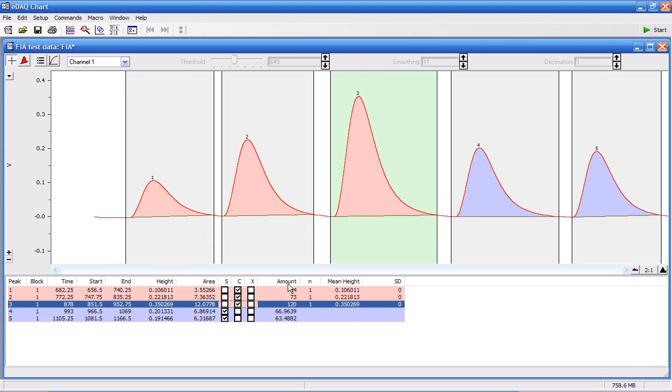What the software does automatically, it's calculated the concentration of my two sample peaks, 66.9 and 63.4.